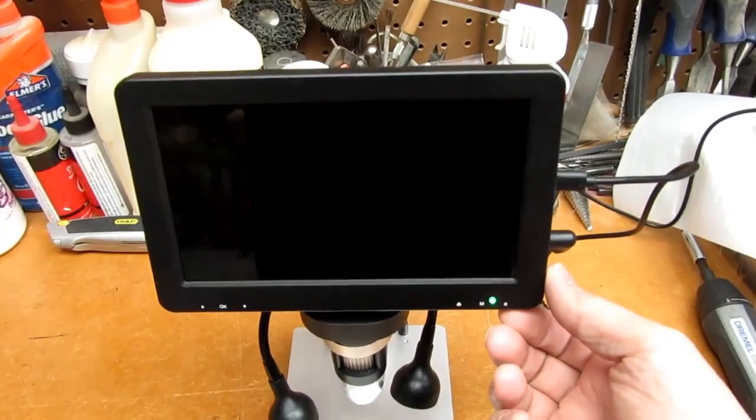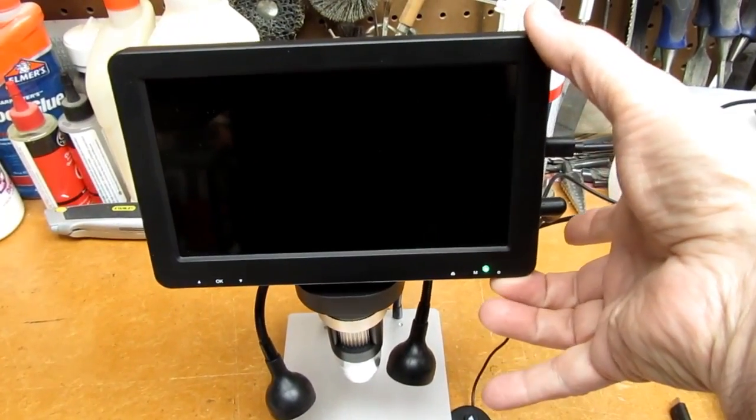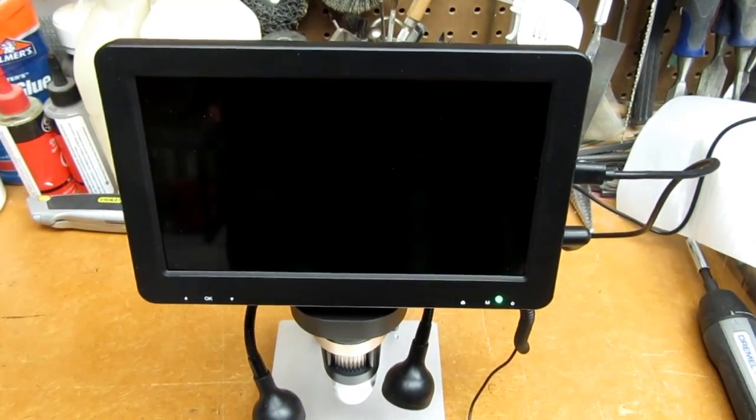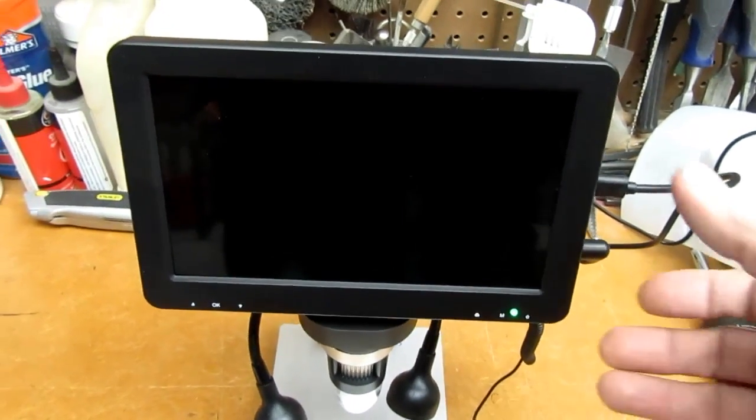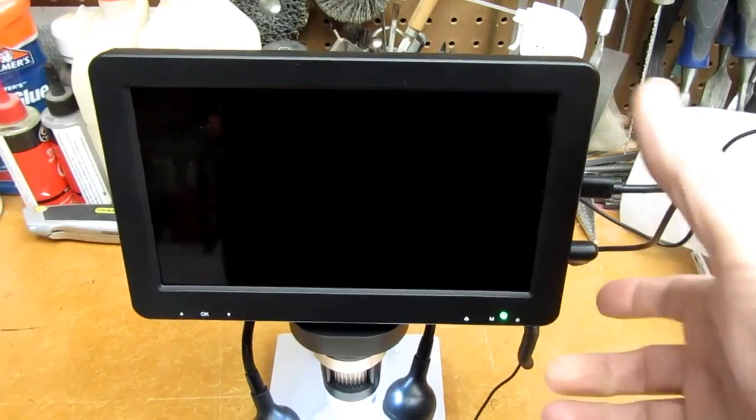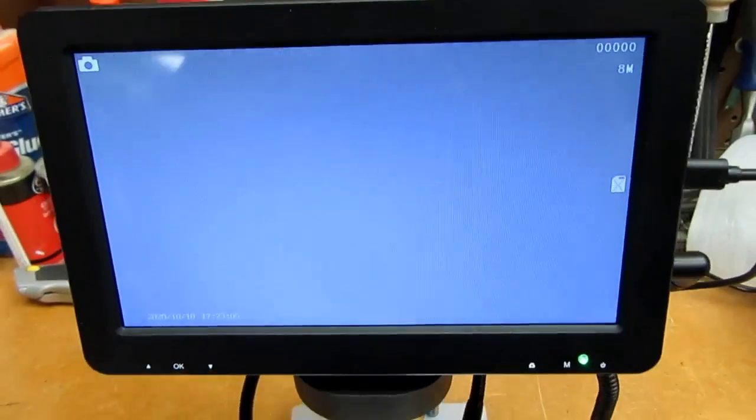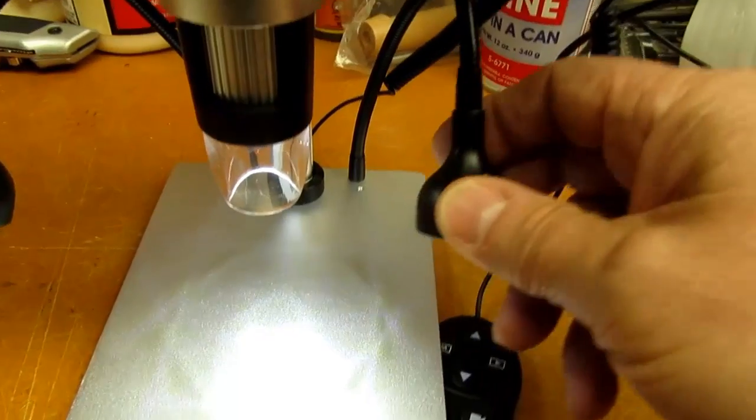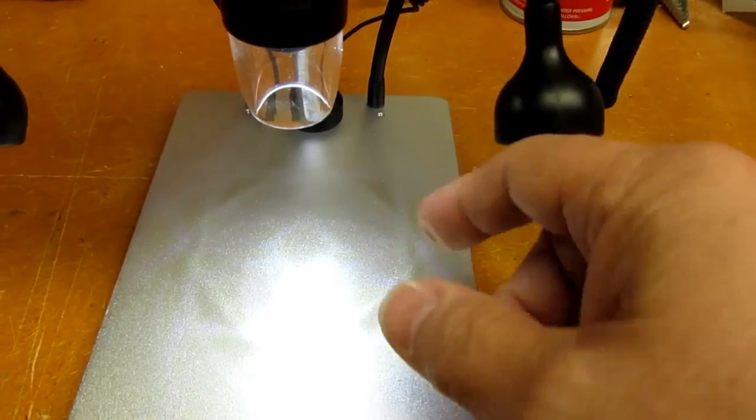So let's turn this guy on. I'll just push the button down here. Give it a couple seconds. There we go, the lamp came on, the screen lit up. Right now it's saying, this will focus, it's saying there's no SD card plugged in. And it tells you what the date is and the time and that it's in still photo mode and some other specifications here probably having to do with resolution. And the lamps down here, the lighting we're seeing here is only from the integral lights up in here.